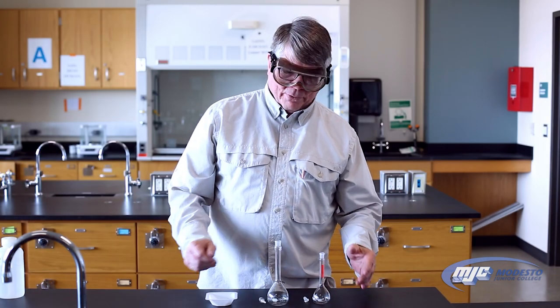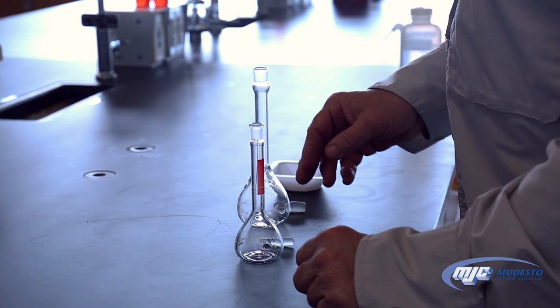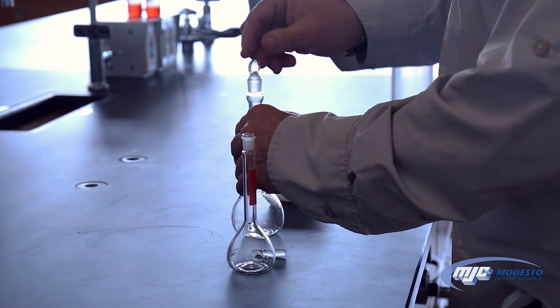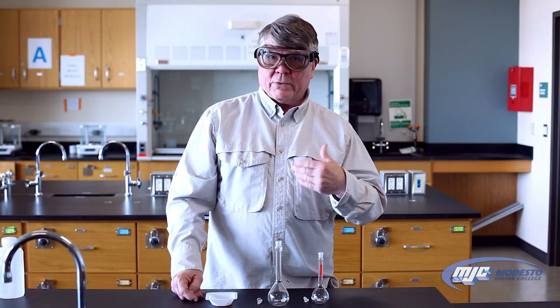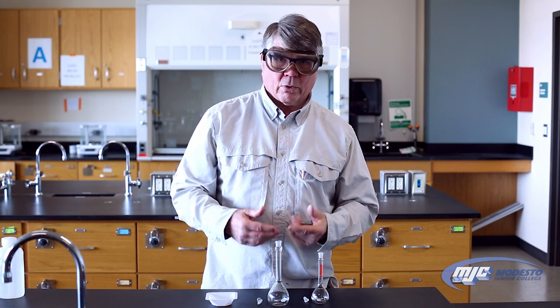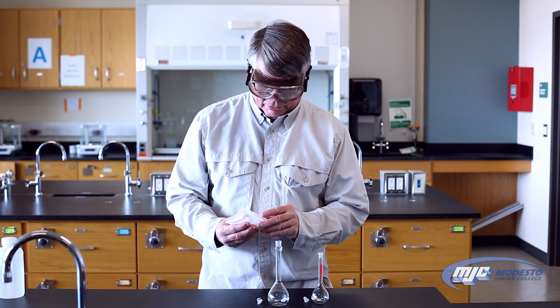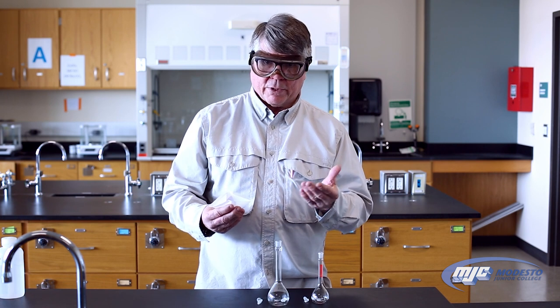This is an explanation of how to use volumetric flasks. We have different sized volumetric flasks, and each of those will have a ground glass stopper that goes in the top. Typically you're going to want to make a solution in the flask. You might be dissolving a solid or diluting another solution. The way to use these is to measure out the amount of whatever you're going to put in there that you need.